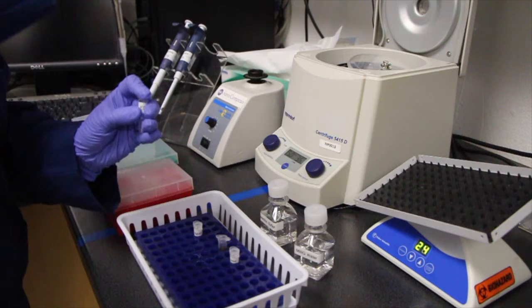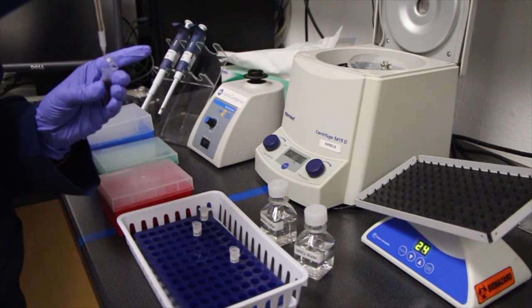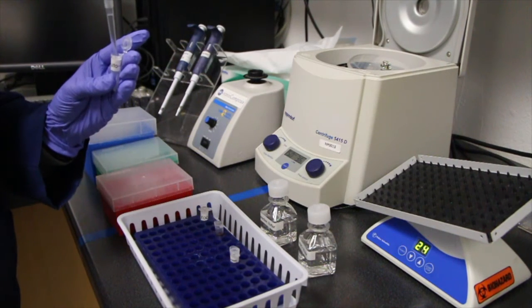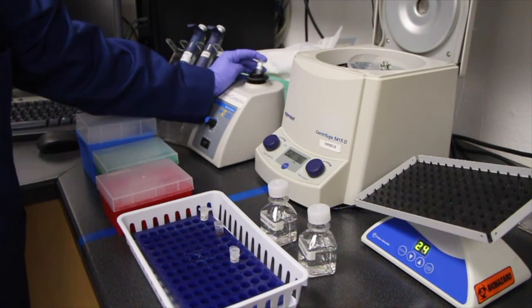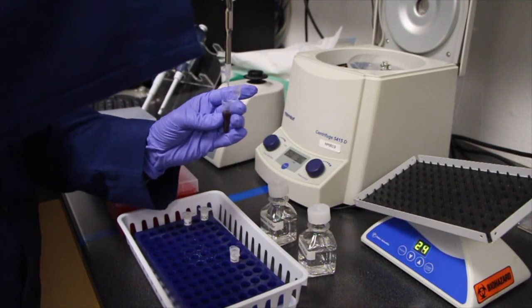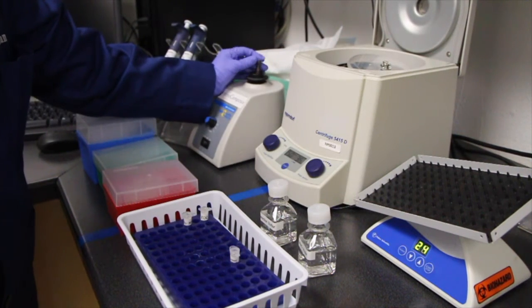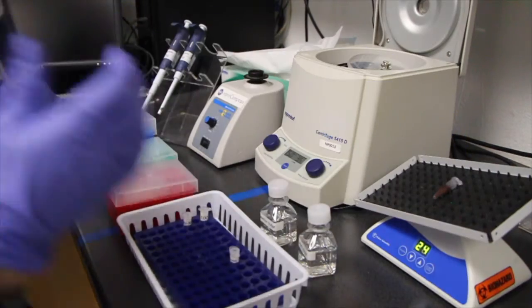For 1 ml of BioReady gold nanoshells, you will need to add 8 microliters of your 10 mg per ml EDC solution. Repeat the process with the sulfo-NHS. Vortex to resuspend. For the same aliquot of gold nanoshells, you will need to add 16 microliters of sulfo-NHS. Vortex to mix and place on a rotating incubator for 30 minutes.